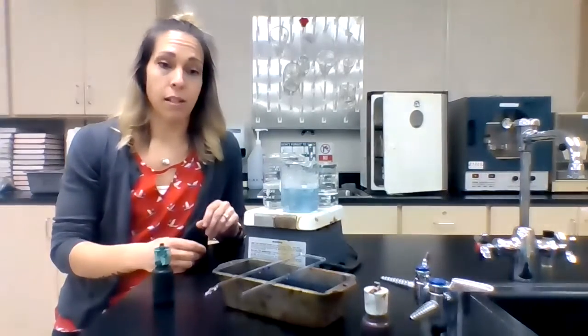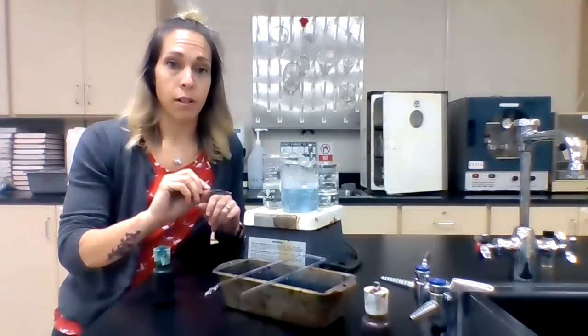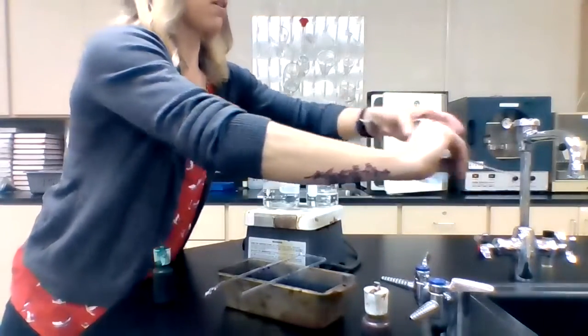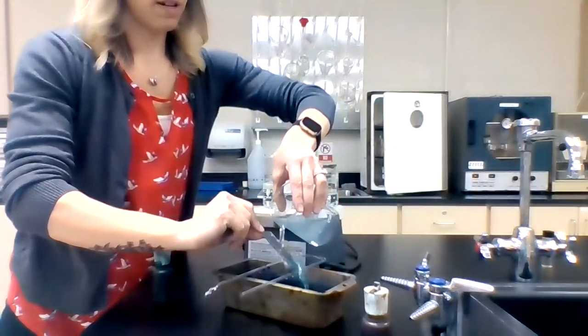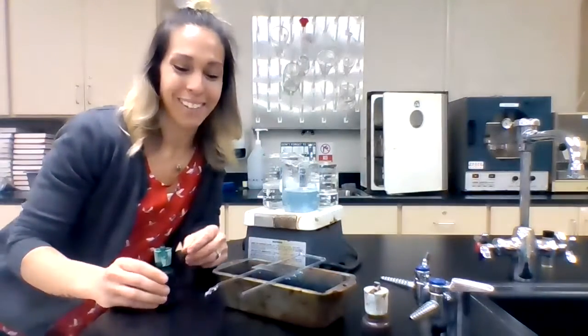After 5 minutes, and this is something that you should time, you're going to carefully, probably using your clothespin, take off your slide. And from here, we want to, and I'll just use this water, we want to rinse the paper towel and everything off. And you'll use your water bottle, not the water from the hot plate.